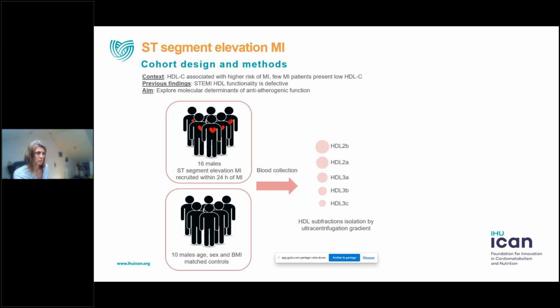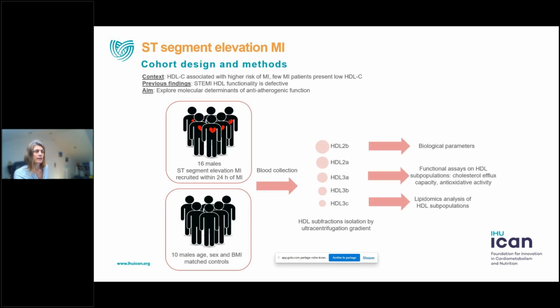We collected the blood, isolated the HDL subpopulations using ultracentrifugation gradient, and ran different analyses: biological parameters, functional assays, and lipidomics analysis on all 5 HDL subpopulations.